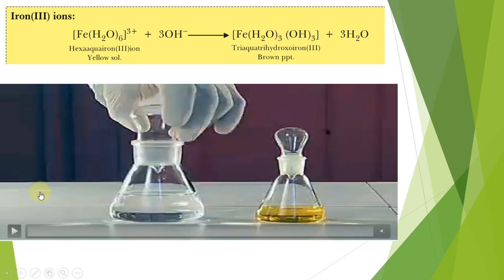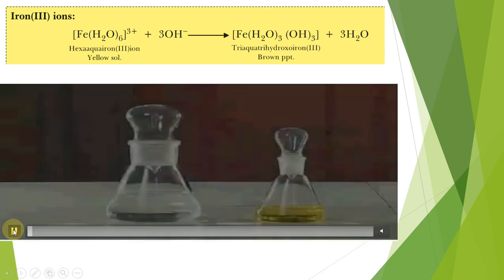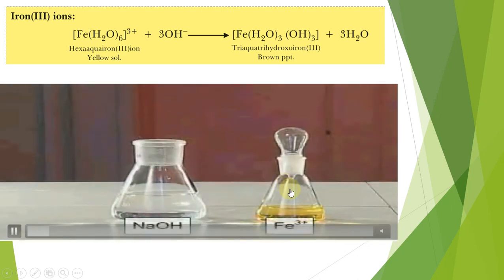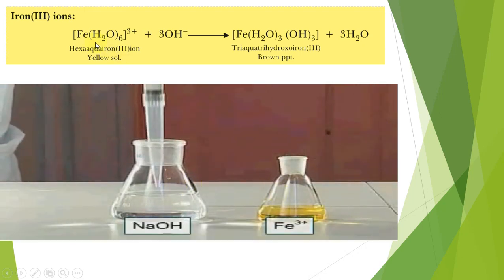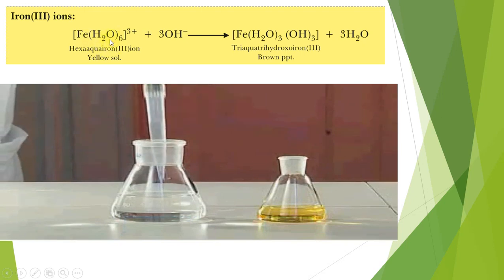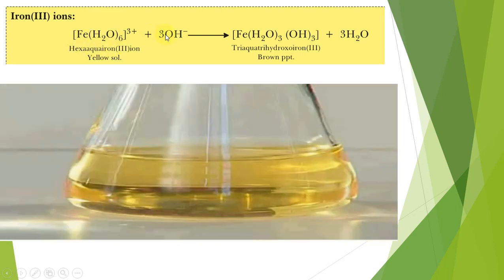If you see the reaction here, this is iron(III) and this is sodium hydroxide; this is iron(III) solution, it exists in this form.